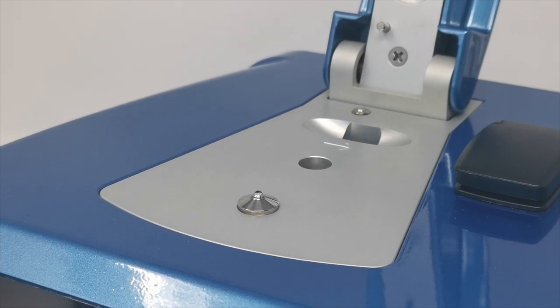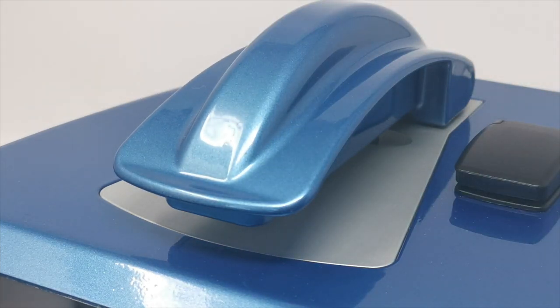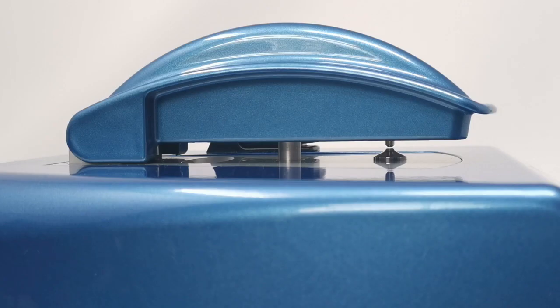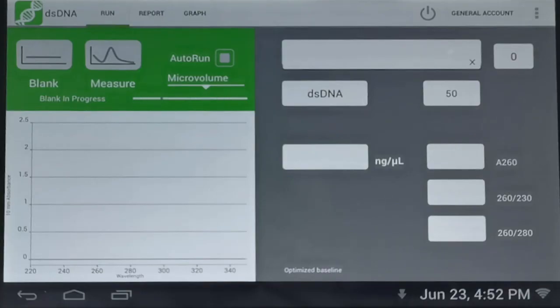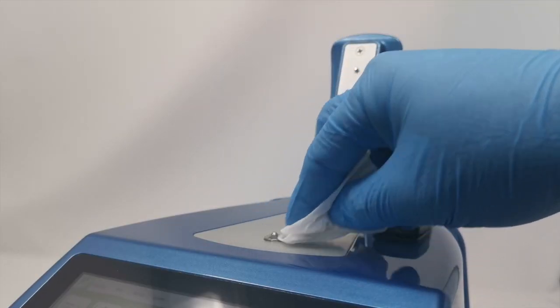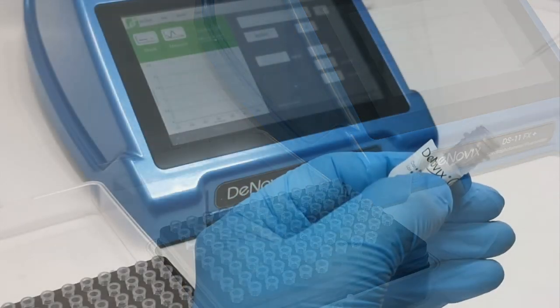We'll put on our blank — it's important that the blank is appropriate for your sample, meaning it should be whatever your sample is suspended in minus the analyte of interest. So if your DNA is in TE buffer, this should be a TE blank. During the blank cycle you'll hear the light firing as the arm moves down and takes the blank at various path lengths, storing that reference spectrum. When finished, the measure button becomes active and we wipe the blank away, ready for the first sample.